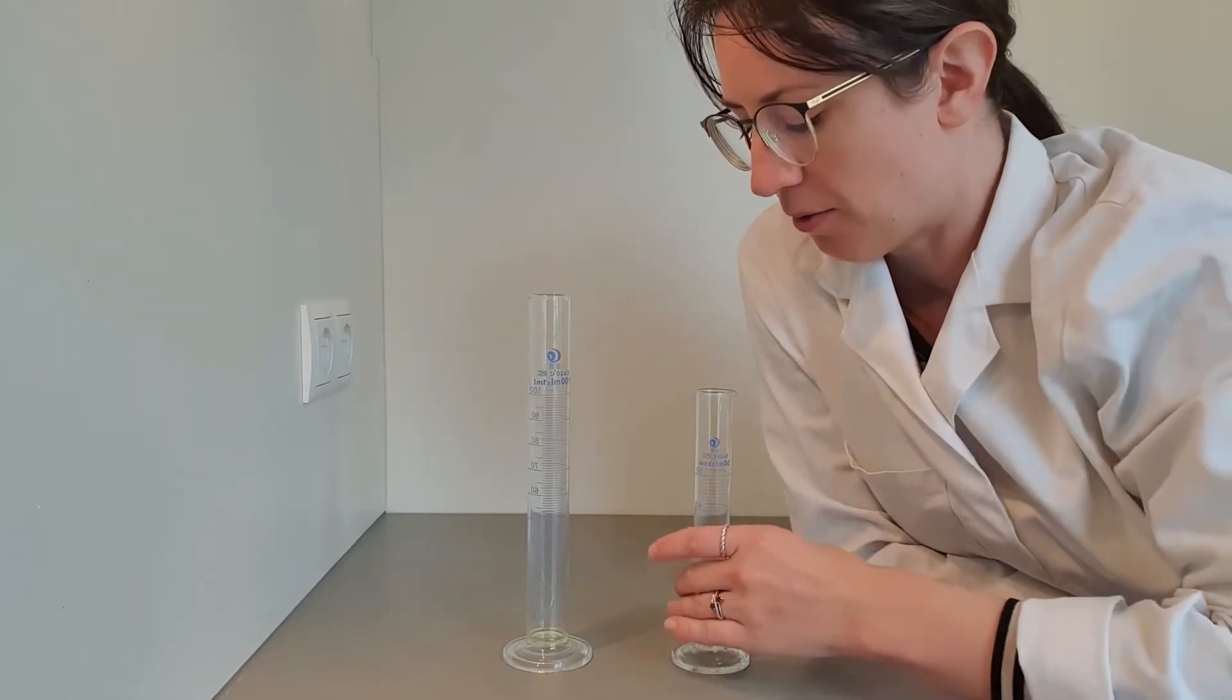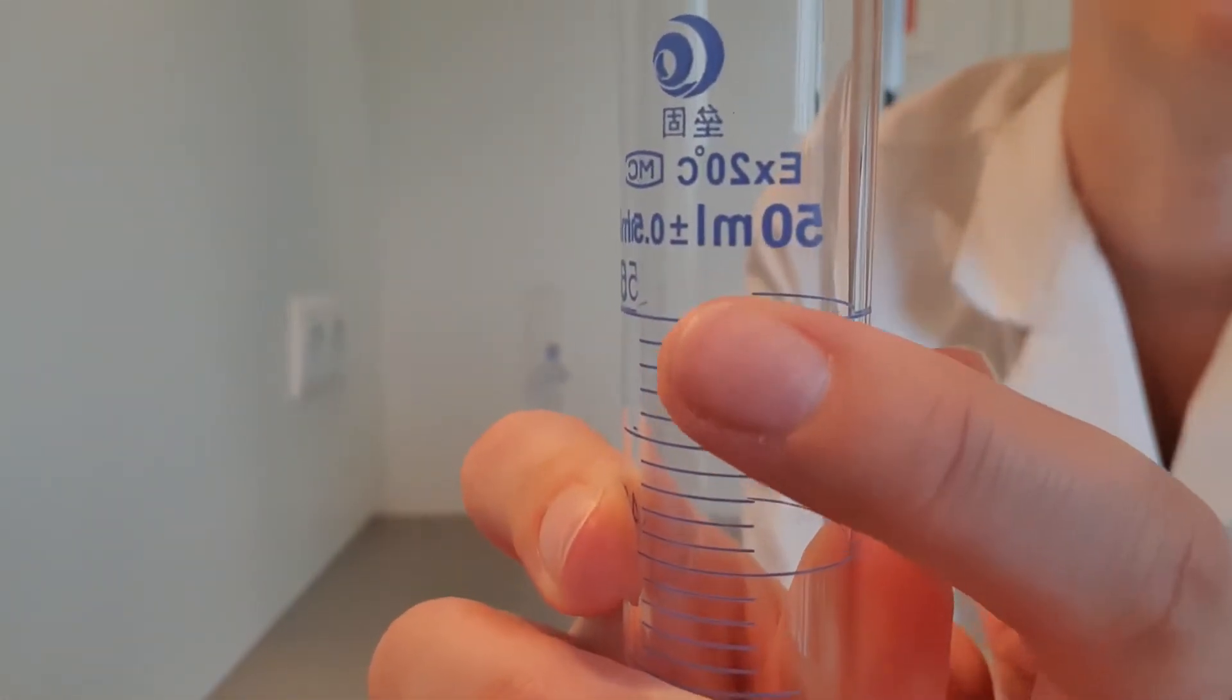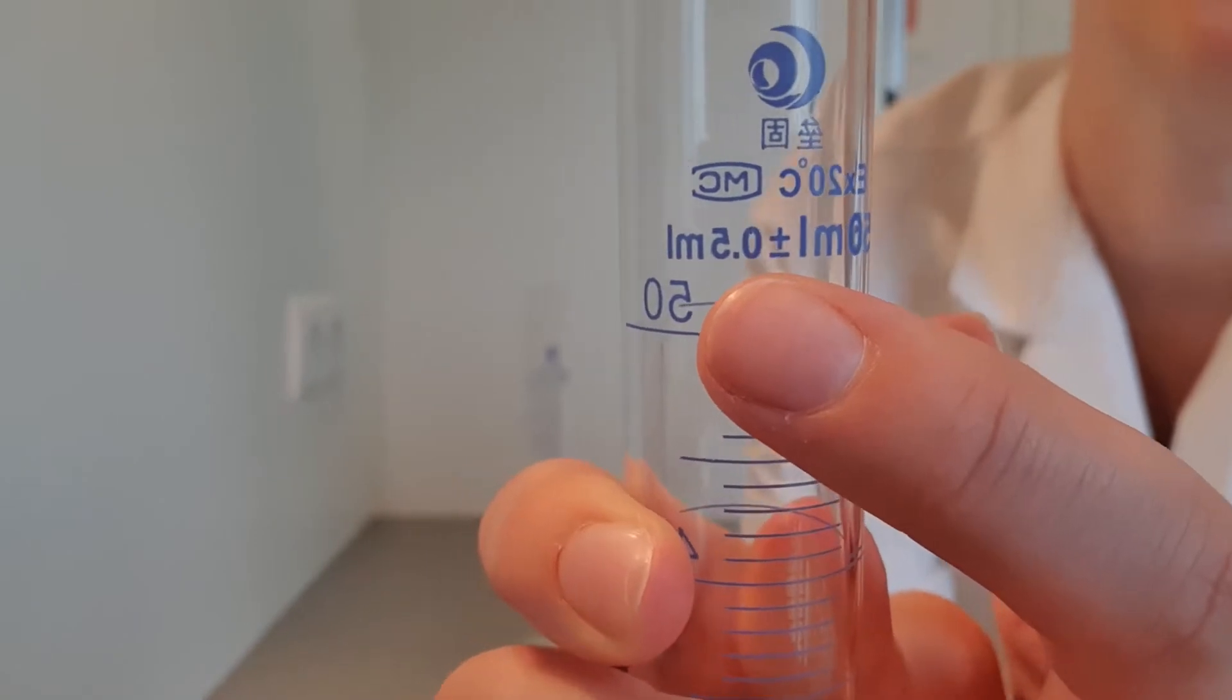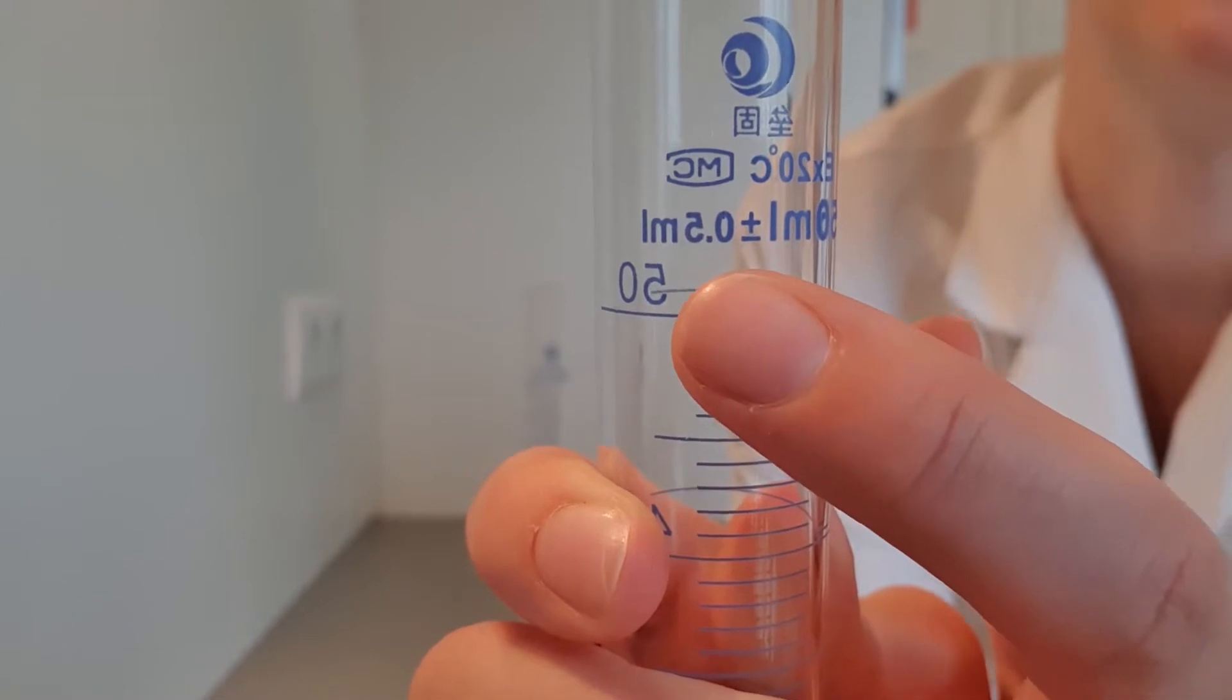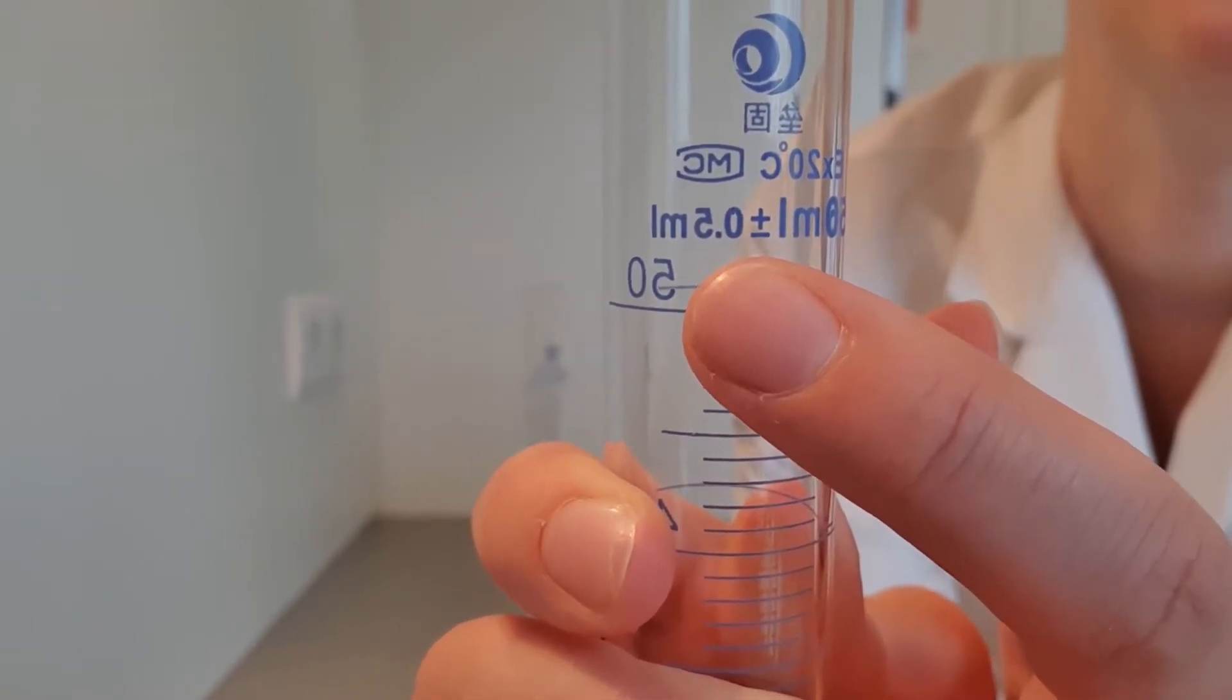So I've got a 50 milliliter measuring cylinder here, and you can see that the volume tells you 50 milliliters, and the plus or minus 0.5 milliliters tells you that this measuring cylinder is roughly plus or minus 0.5 milliliters out, so it's slightly imprecise by that volume.